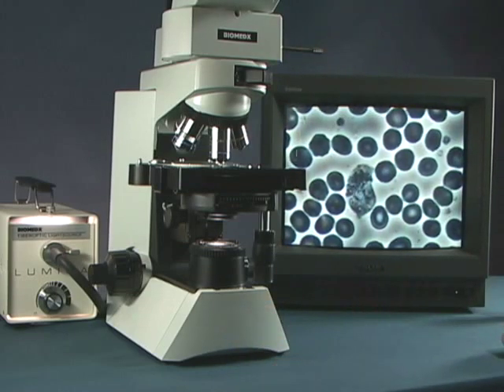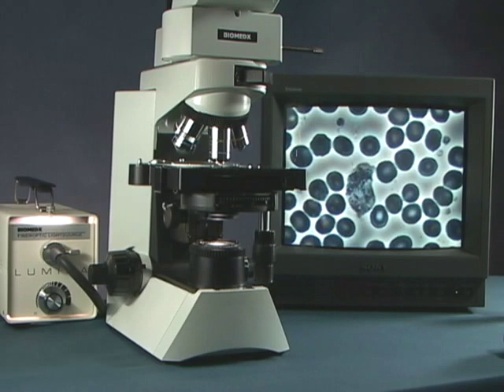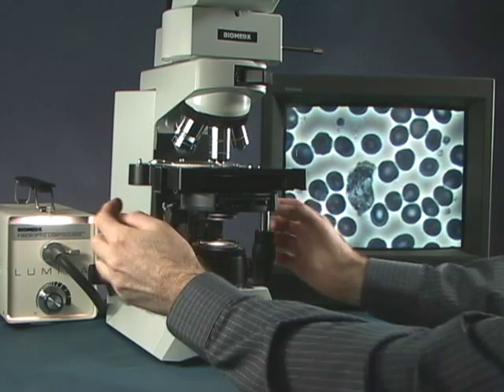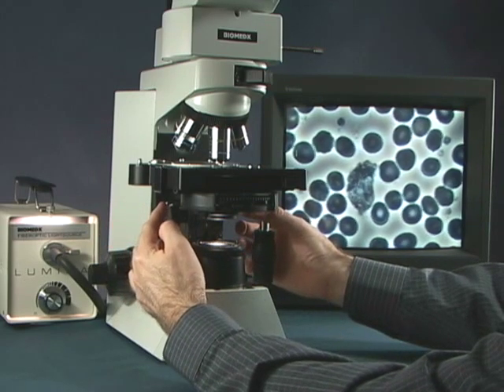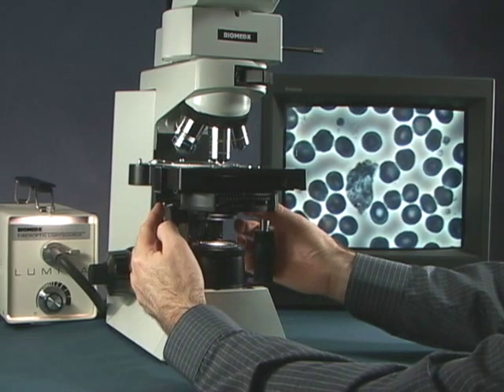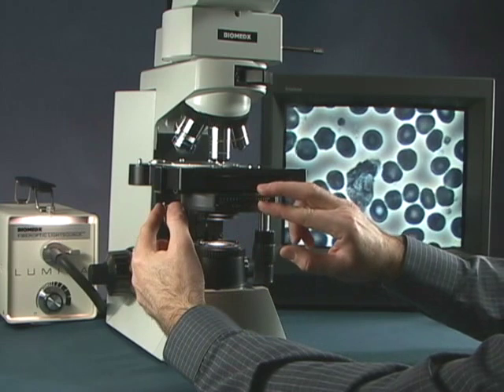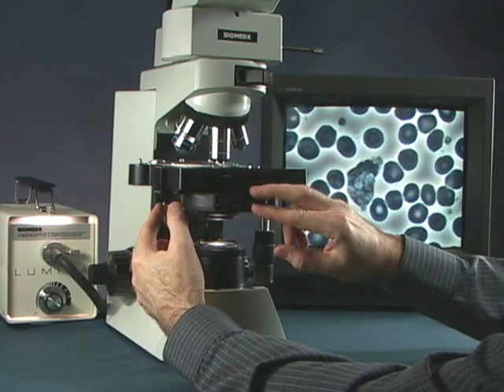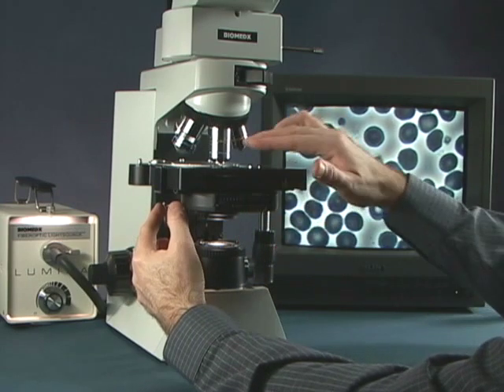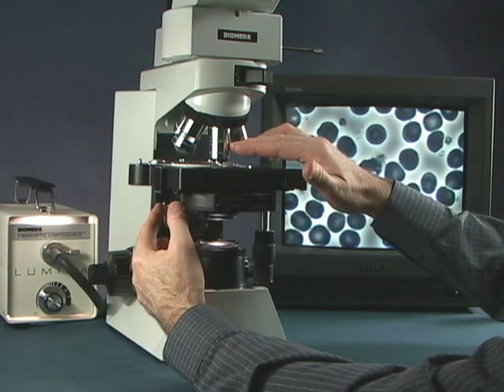With that in place, when we look into the centering telescope, we will actually use these adjusting knobs right here on either side of the condenser to adjust the phase annulus that is in the condenser here to be in alignment with the phase ring that is etched into the objective right up here.